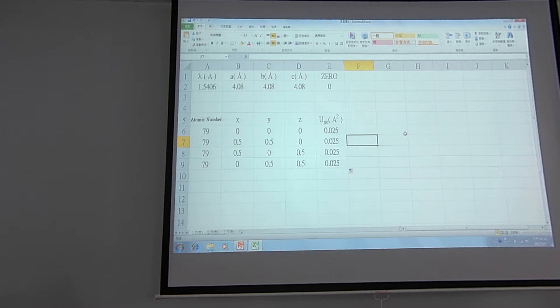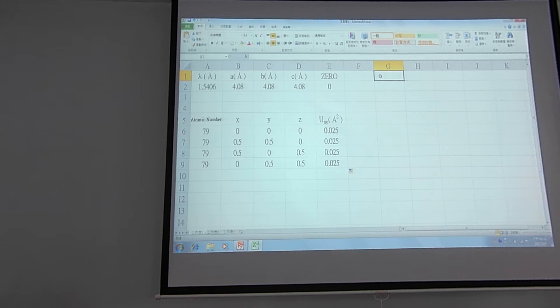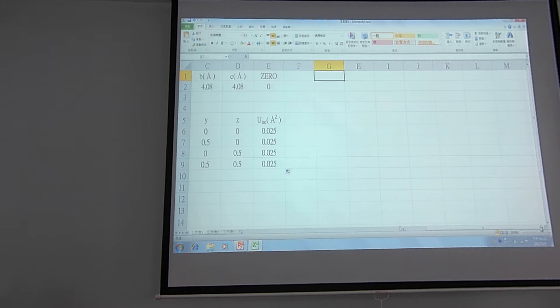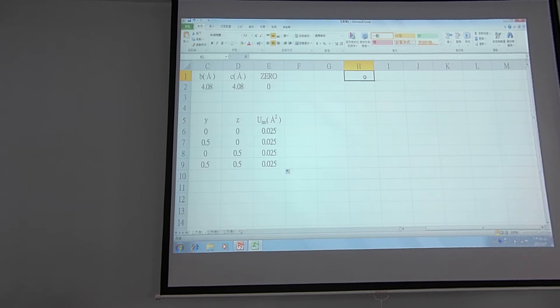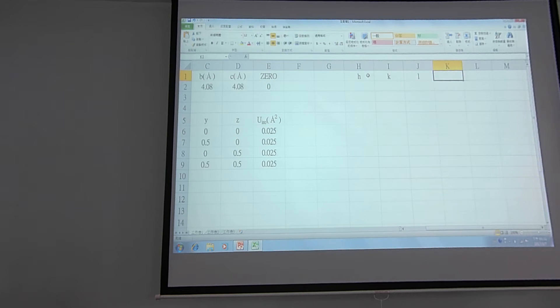Now let's set up the calculation part. The first thing we need to set up is to identify which crystal planes will give you a strong reflection. You need to set up the Miller indices here, so we will type h, k, and l in each cell.